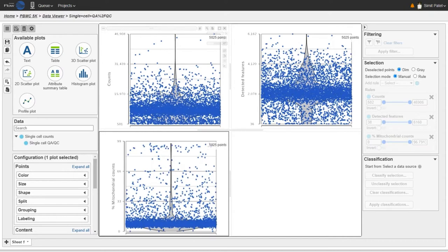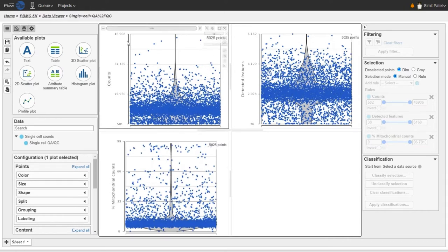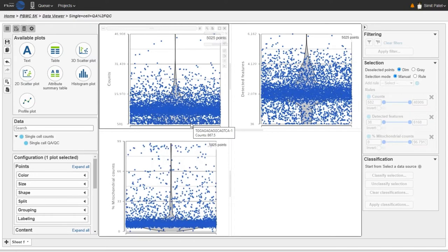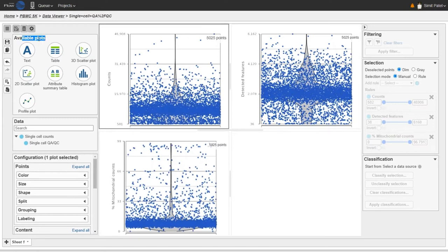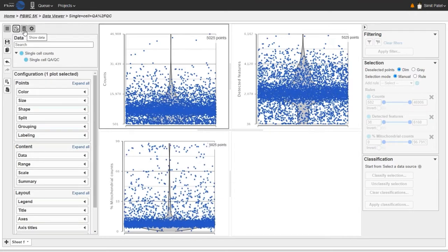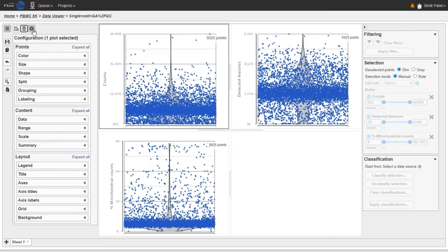Each blue dot in these plots is a different single cell — you can see from the figure legend there are roughly 5,000 cells. The cells are positioned along the y-axis according to their quality metric; the position along the x-axis is not so important. Let's configure these plots to see the patterns a little bit better. I'll start on the left-hand side by removing the available plots card and the data card, leaving just the configuration card. The configuration card has lots of options — I encourage you to go through each one to understand how they all work.